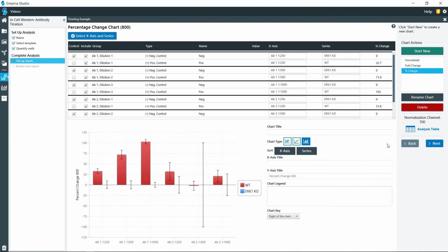So, and this is probably, as I mentioned earlier, the most complex version of charting that are used in the plate-based assays. But it is a good starting point for learning how to properly chart your plate-based data.